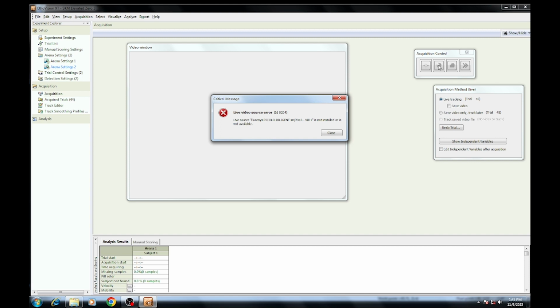At the end of the session, you can click on this red square button right here, and it will end the testing session. And in between those testing sessions, the animal runner will send the animal back to its home cage, while the other student will be working in the room to clean the maze and prepare for the next animal.